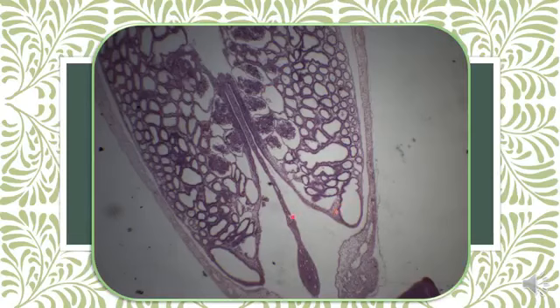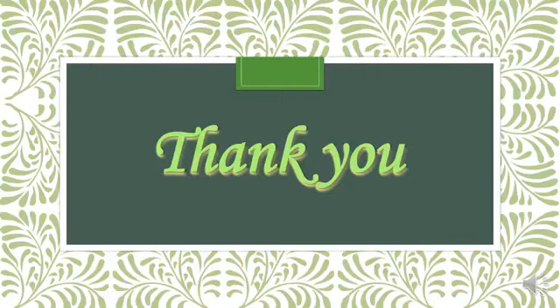Also in these sections you can see the hindgut containing the dorsal mesentery only. The hindgut has a dorsal mesentery only. This is the dorsal mesentery of the intestine. And the cavity of the renal system, peritoneal cavity. Thank you.